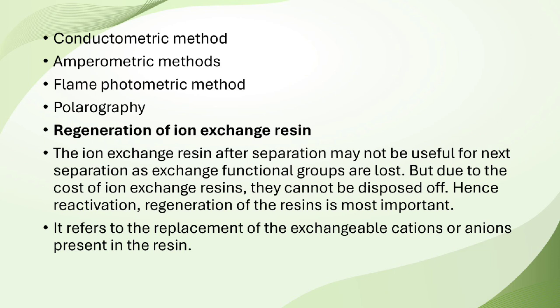Regeneration of ion exchange resin. The ion exchange resin after the separation may not be useful for the next separation as exchange functional groups are lost. But due to the cost of ion exchange resins, they cannot be disposed of. Hence, reactivation or regeneration of the resins is most important. It refers to the replacement of the exchangeable cations or the anions present in the resins.